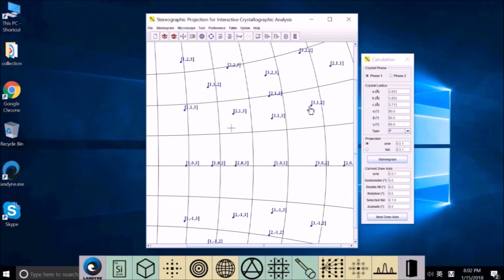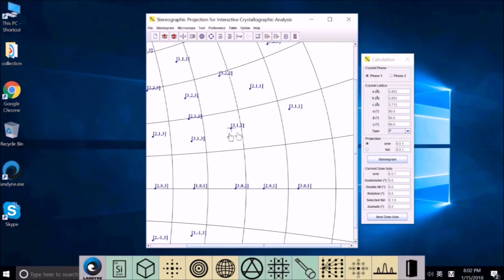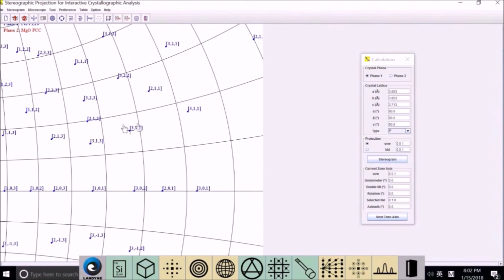And after that, 313 again, 312, control button. So you can always move this one into, and if I expand it, so you can see this one in the center of the screen.